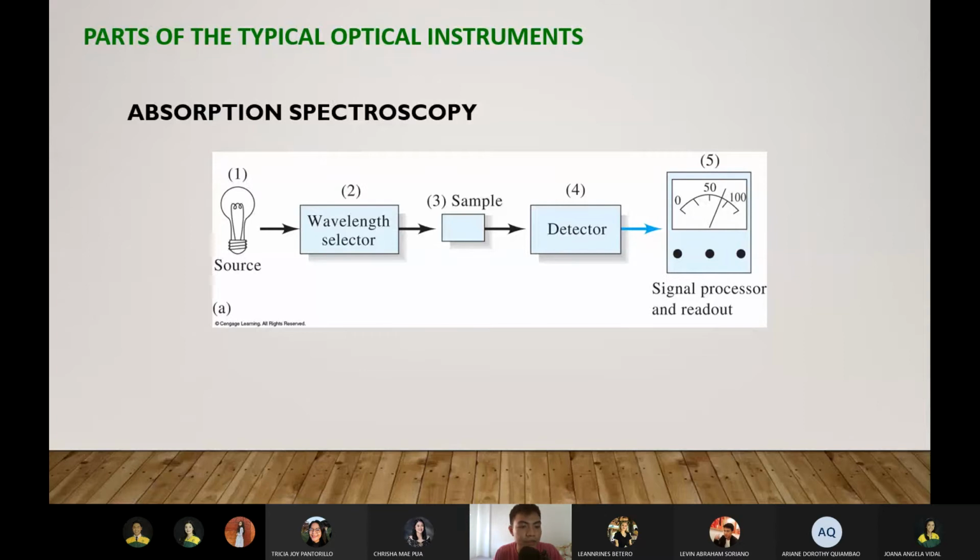Okay, pag-usapan natin yung mga nangyayari. On the leftmost side, dito yung light source mo. Basically, mga special lamp yan. What we know about lamp is that they produce all forms of wavelength. For example, itong liwanag ng aking desk lamp, halo-halo kulay dyan: red, orange, yellow, green, blue, violet. Kasi alam natin, yung white light ay combination of all colors, di ba?